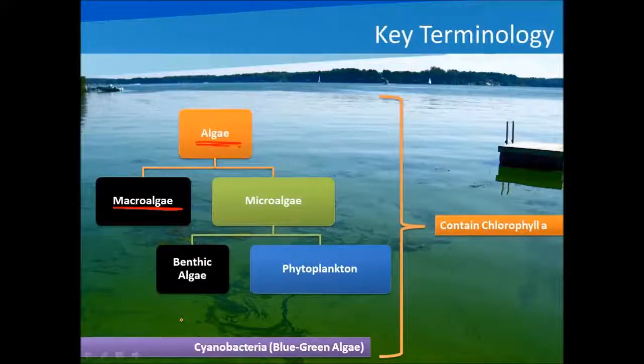And then there's also microalgae, and as the name implies, this is the microscopic photosynthetic organisms in the water. Through photosynthesis, this microalgae is responsible for close to 50% of the atmospheric oxygen production. Now our sensors are focused on measuring this microalgae, and we use two different channels.